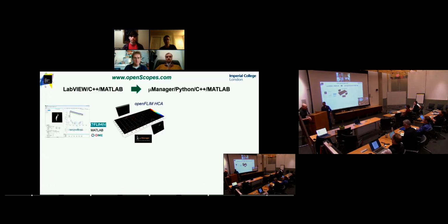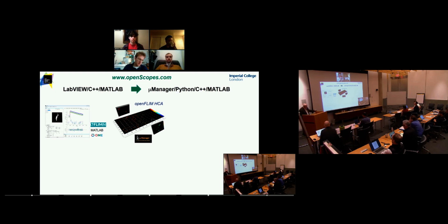Hey, we've got it. So good morning, ladies and gentlemen. I'd like to echo the sentiments of the previous speaker, Kevin. We moved from Labview some years ago. We were using Labview, C++, and MATLAB. We particularly work in my group on fluorescence lifetime imaging. We have a widely used program called FlimFit for complex analysis, and we also wanted to develop high throughput fluorescence lifetime imaging for FlimFret assays.